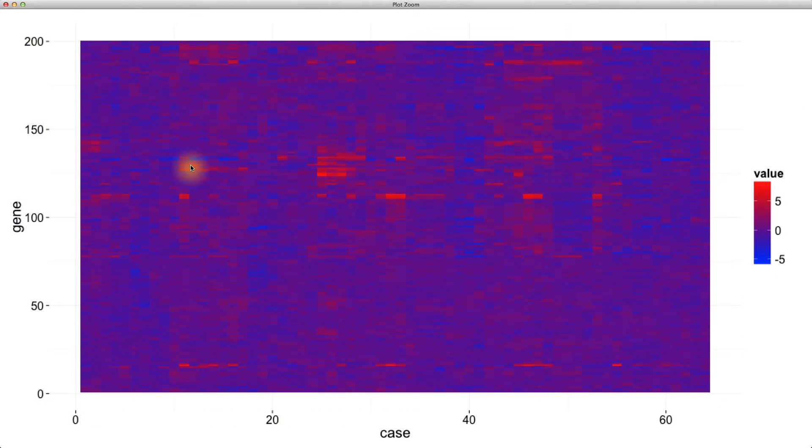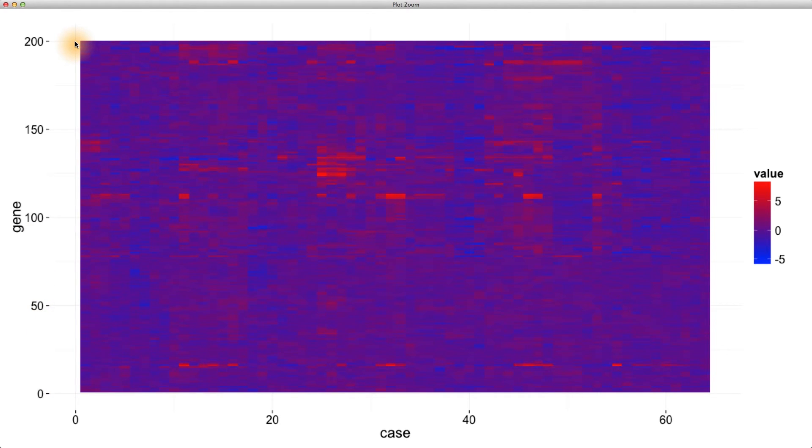Even with such a dense display, we aren't looking at all of the data. In particular, we're just showing the first 200 genes. That's 200 genes of over 6,000 of them.